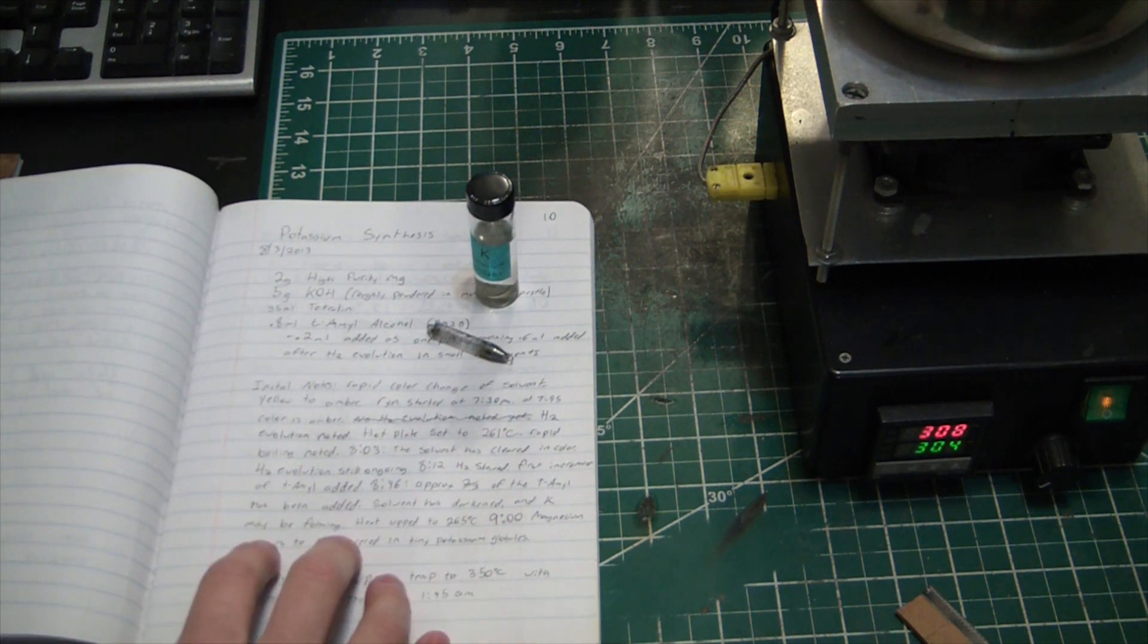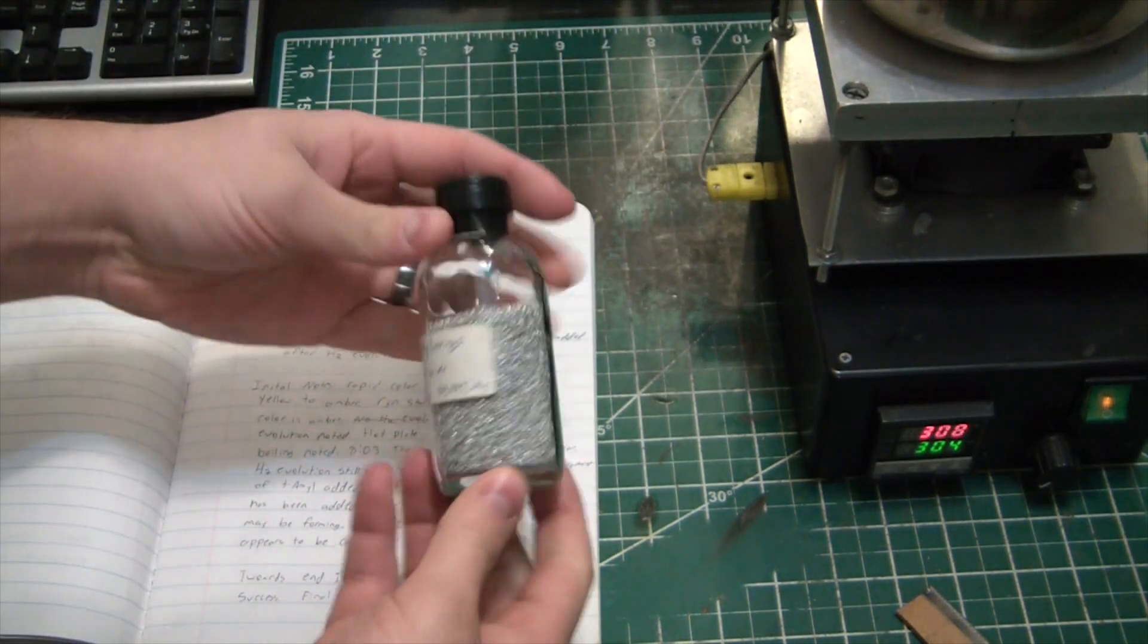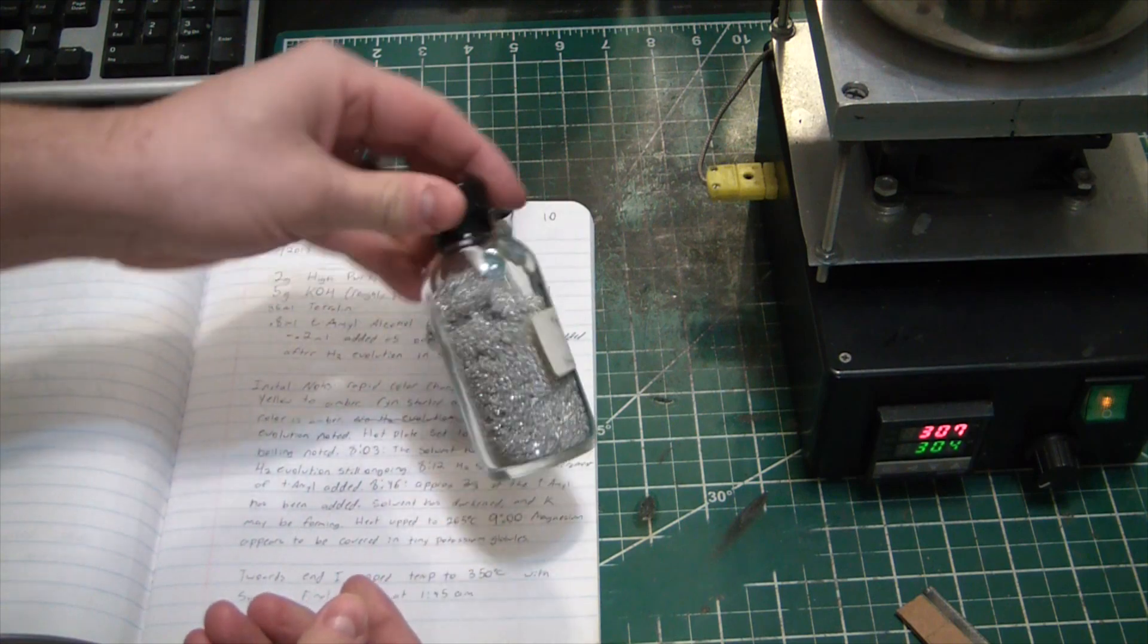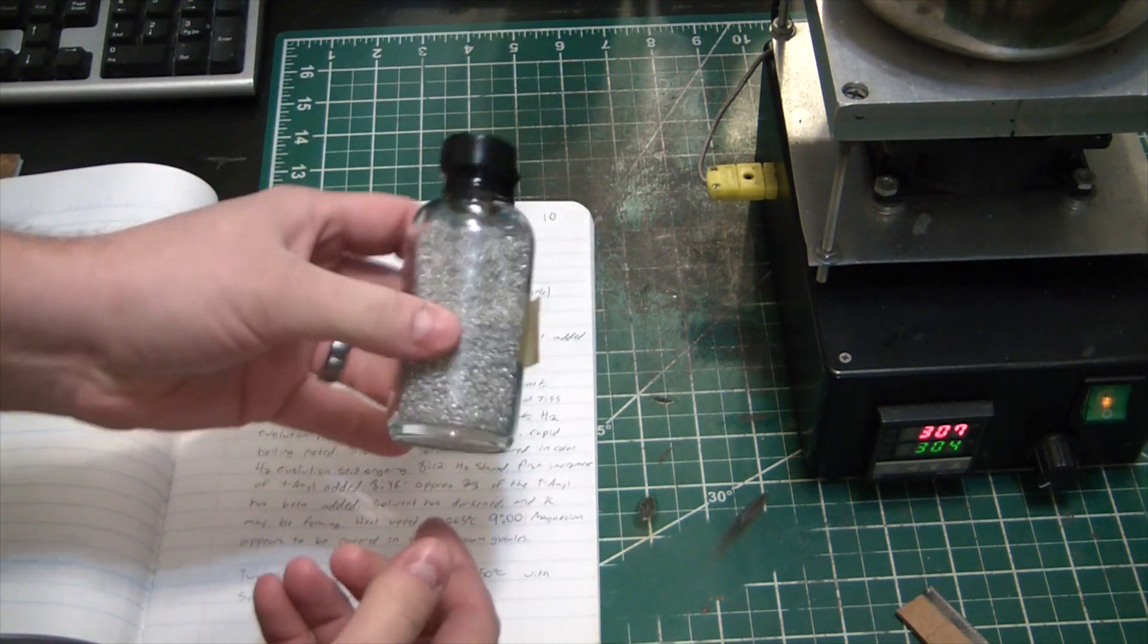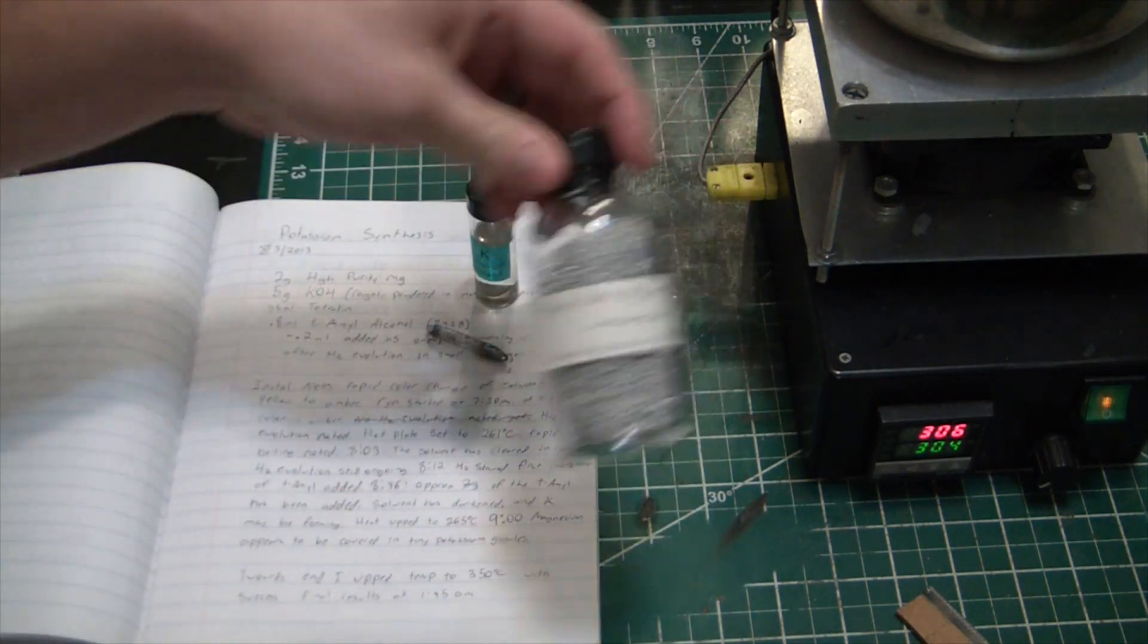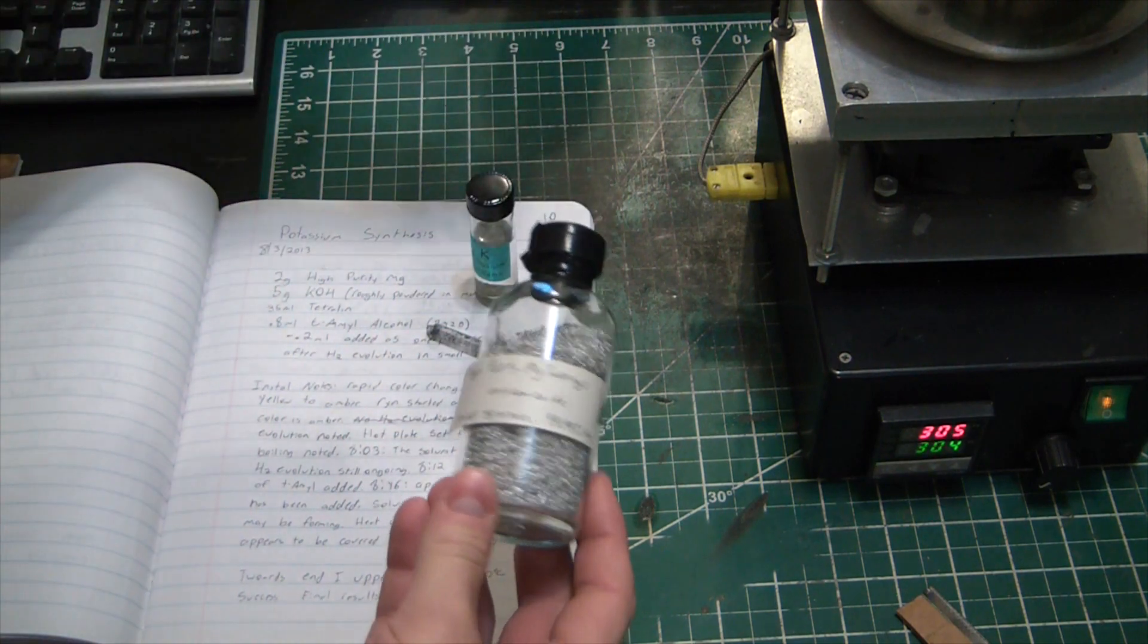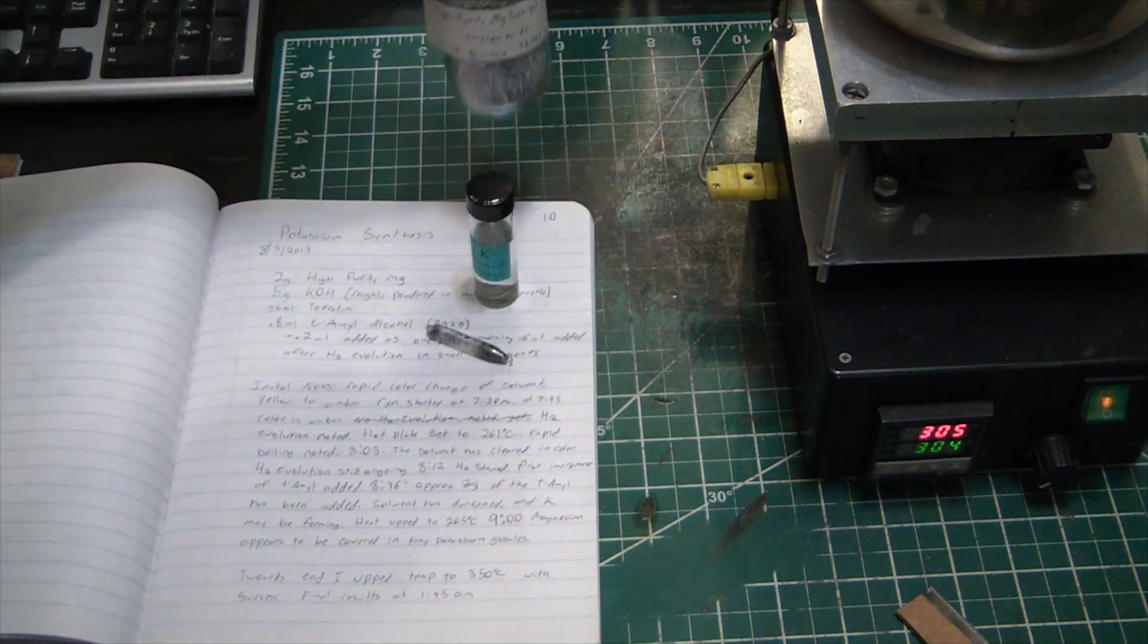So I was able to get a big block of high purity magnesium and I milled some turnings on my CNC mill and kept them under argon and sealed the bottle. So hopefully they're still good. Hopefully there's not too much oxides in there at this point. I did make them all the way back in 2013, so it might be a little old, but we'll see.